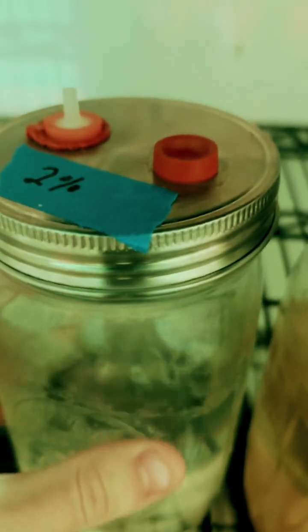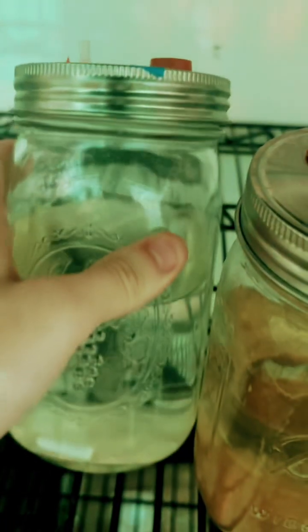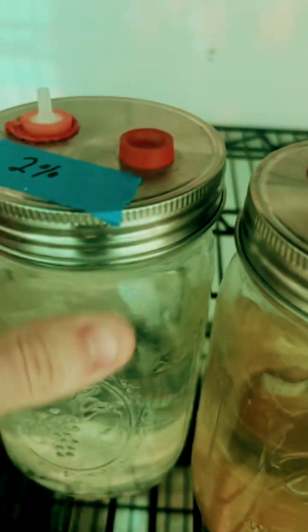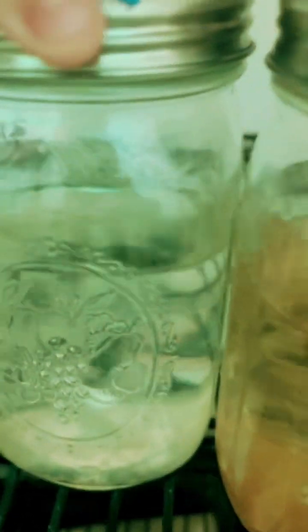Now we're gonna step over to 2% rye mix with liquid and you can see there's some growth growing on there. It's just really hard to see.